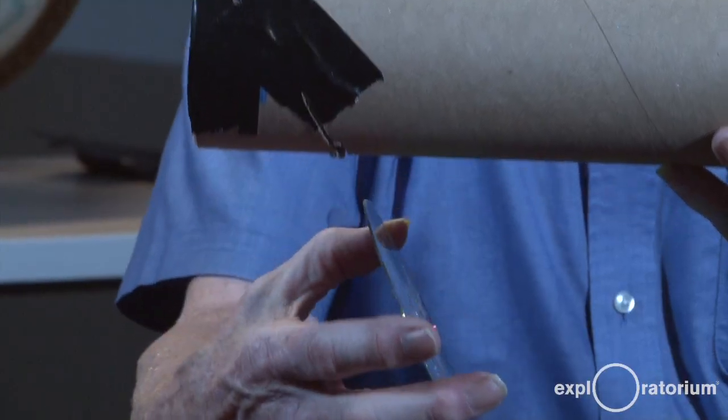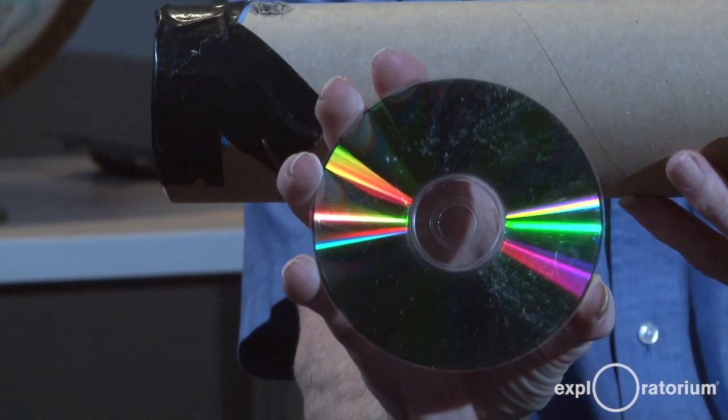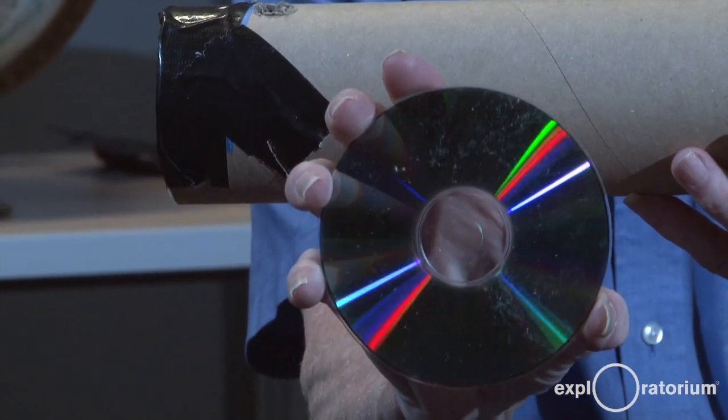Hi, I'm Paul Doherty from the Exploratorium Teacher Institute, and today I'm going to have you build a spectrometer — something that I call a truth-teller for light — because it splits light up into its spectral components, into different wavelengths of light. This spectrometer has four major parts. It's got a compact disc, which is the diffraction grating, which breaks up light into its color.